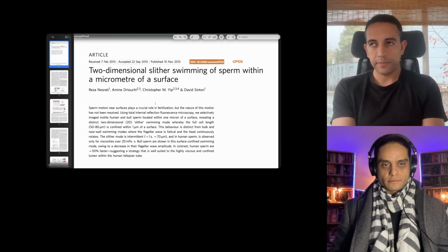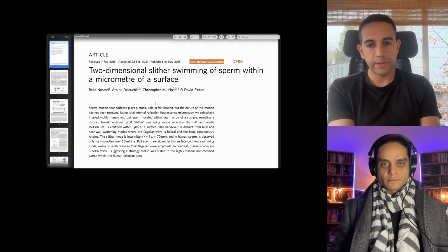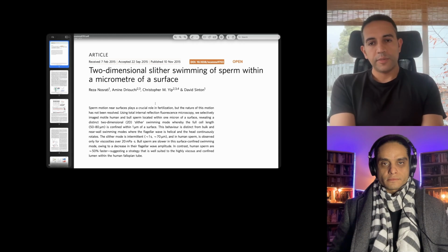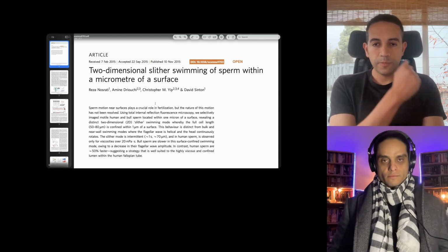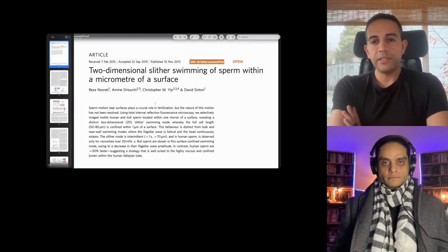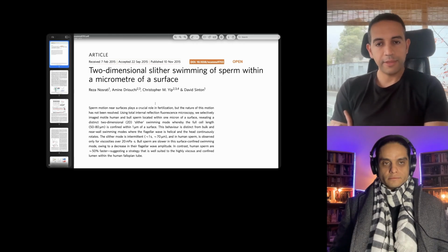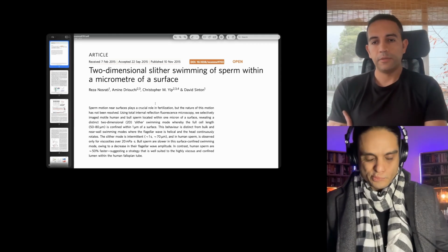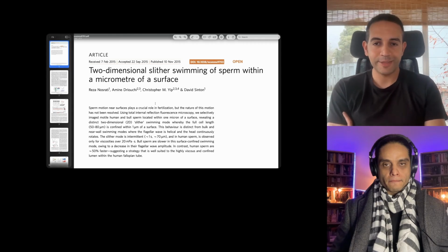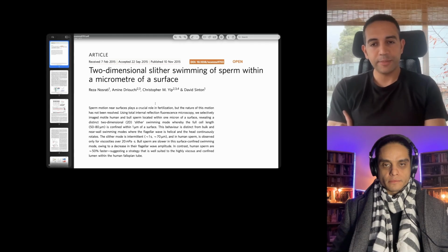So it's exceptional for looking at, say, plasma membrane proteins. And people have done a lot of work using total internal reflectance fluorescence to study the spatial distribution of membrane proteins and rejecting signal from the cytoplasm and the nucleus. And of course, the devil is in the details. By no means are you capturing the membrane alone, which is much thinner than that, and to do your characterization, you want to look at things like early endosomes, for example, since they are going to be close to the membrane, and see to what degree your well-calibrated microscope is actually capturing them or not.